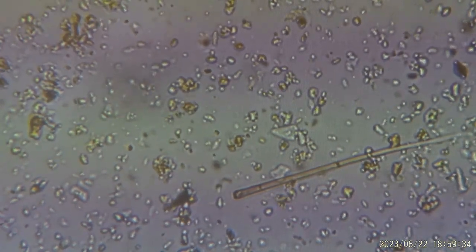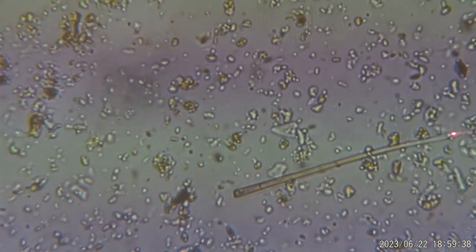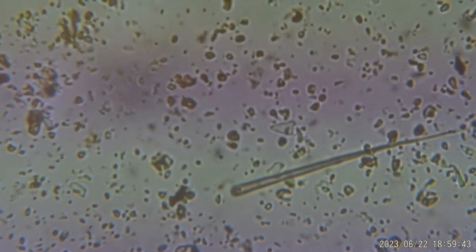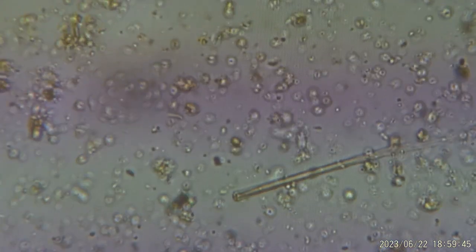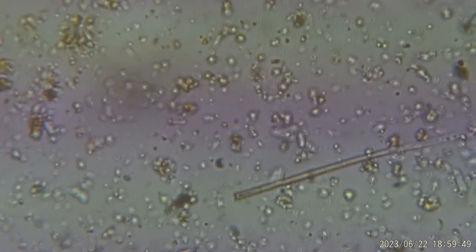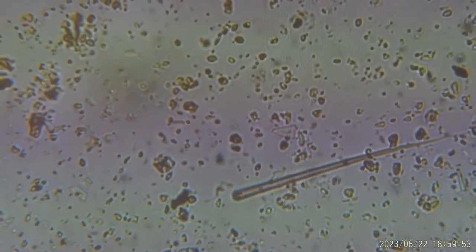The part on the left is actually at a higher plane than the one down there. It's just a little deeper. So that's a fungal hyphae. There appears to be a fungal spore up there. Lots of bacteria here. I'm not seeing a ton of aggregation though.